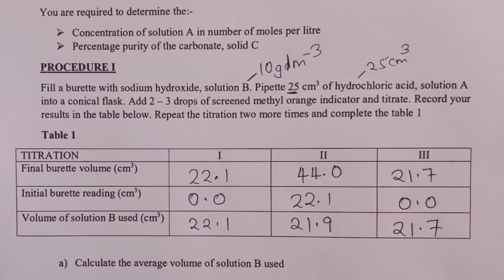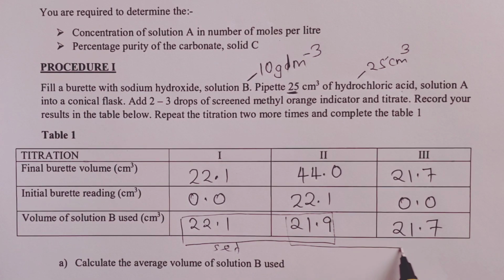These volumes ensure that the first 2 values form set 1 of volumes that can be averaged, and the second and third also form set 2 of values that can be averaged.